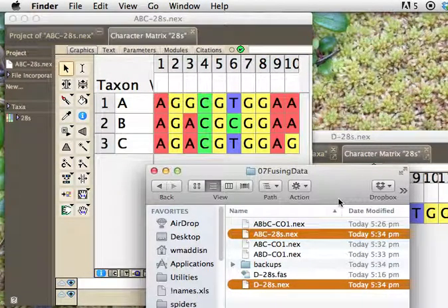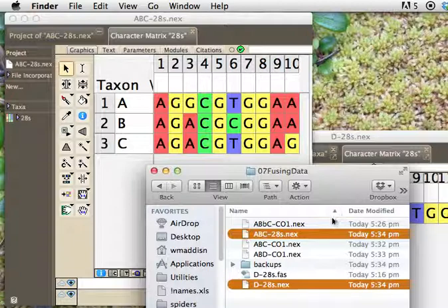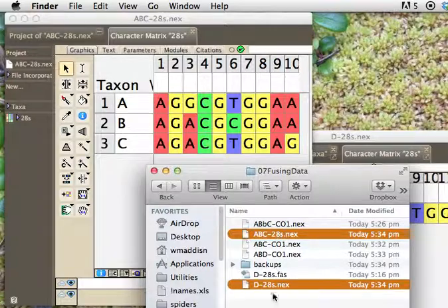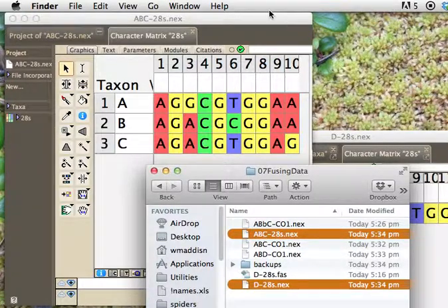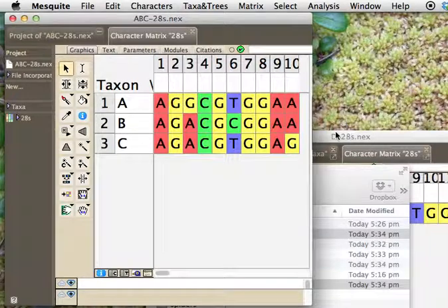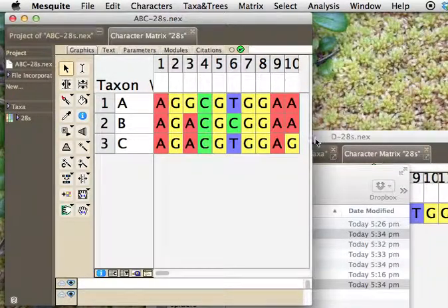We're going to look at how to fuse data from different matrices into a single file. I'm supposing we're starting with two different files here that I've highlighted, one that's got 28S sequences and one that's got more 28S sequences, and here's what they look like within Mesquite.